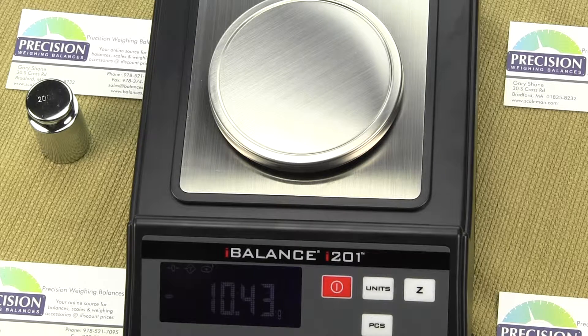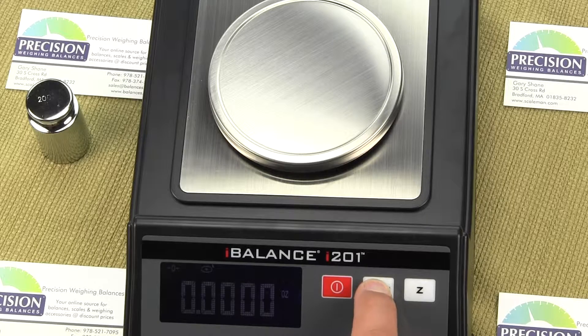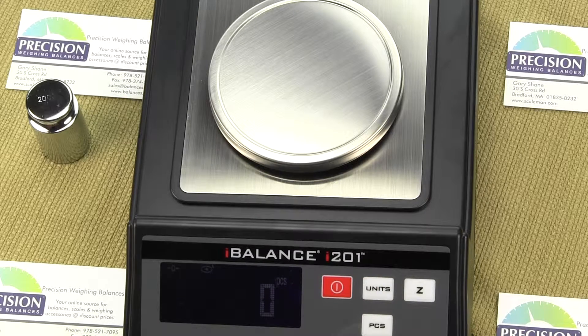The scale has a parts counting mode. To get into it, press the units key until you see PCS displayed. Then press the PCS key and you will see sample size options: 10, 20, 50, or 100. We're going to use 20 pieces as our sample, so we'll select 20.